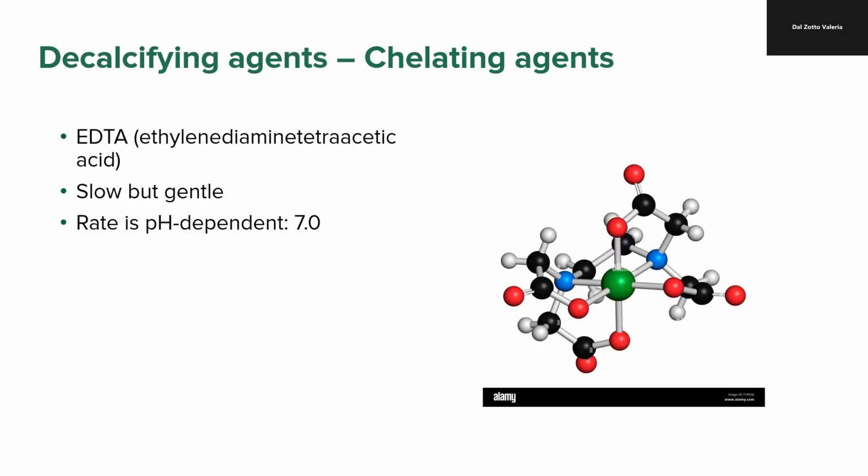The chelating agent is EDTA. We don't have EDTA yet. We have it, but we don't use it routinely. It's very slow. It doesn't work as an agent that binds or gives protons to the solution, but it's a complex molecule that entraps the calcium by covalent bonds, and it doesn't allow the calcium to return to the bone.